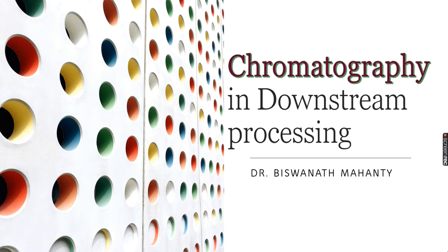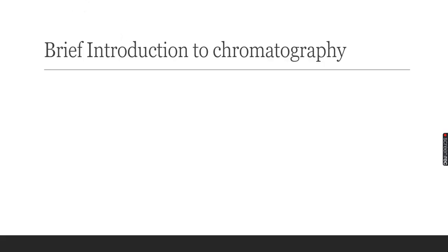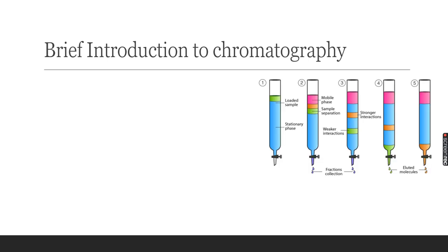Hello, we'll be discussing chromatographic techniques in downstream processing in this class. Basically, we'll be discussing the introduction to chromatography. We believe that you already have some fundamental idea of how chromatography works, but we'll have some recapitulation of those topics in this class.